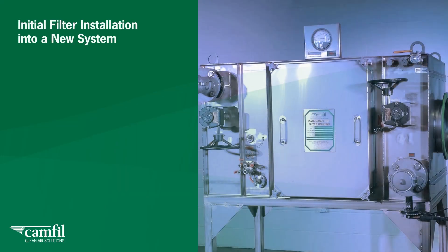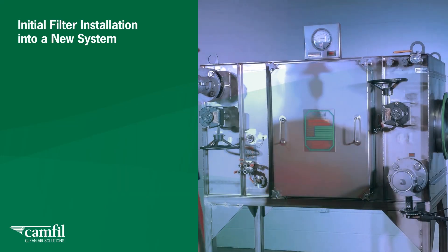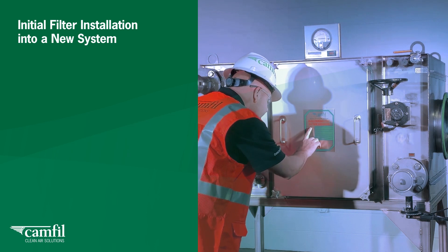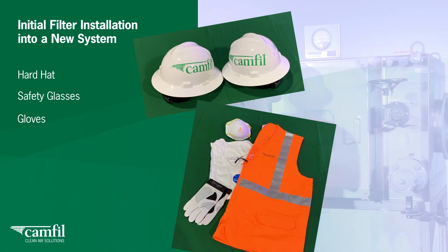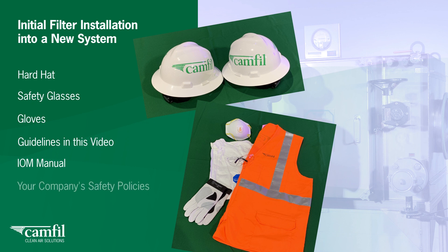Prior to beginning the filter installation for a CAMFIL bag-in, bag-out, or safe-change filter housing, check with the owner's safety officer for the site PPE requirements such as hard hat, safety glasses, and gloves. Use the guidelines in this video, the IOM manual, and any overriding procedures of your company's safety policies.